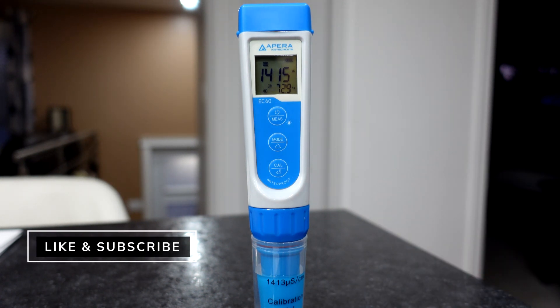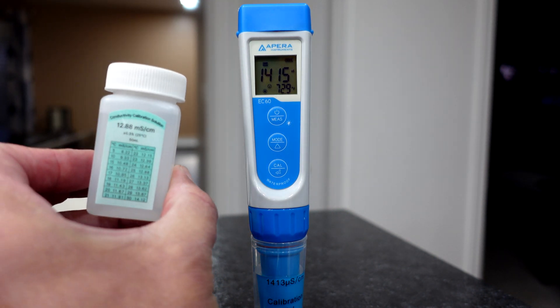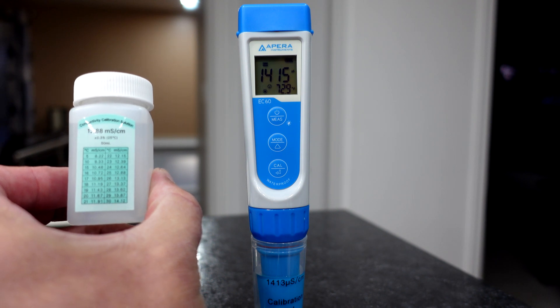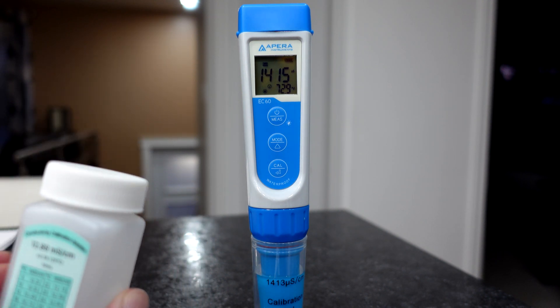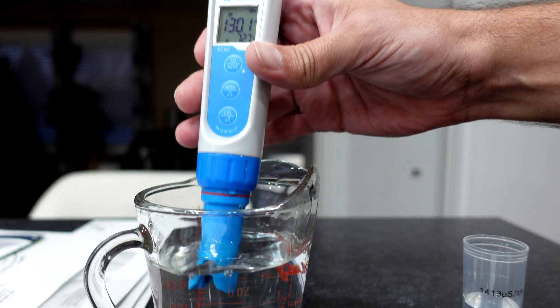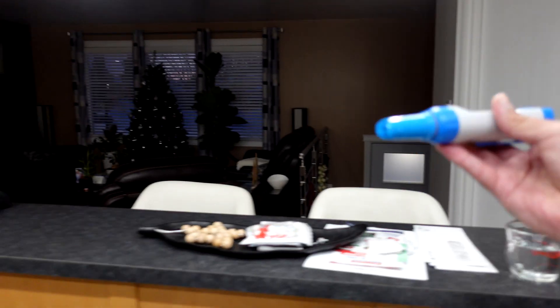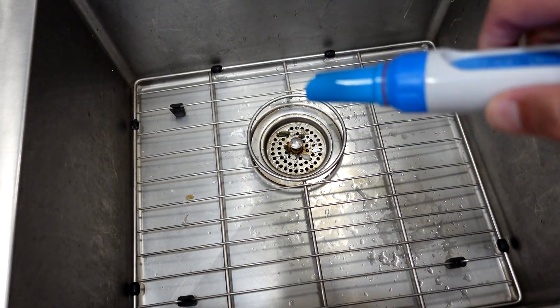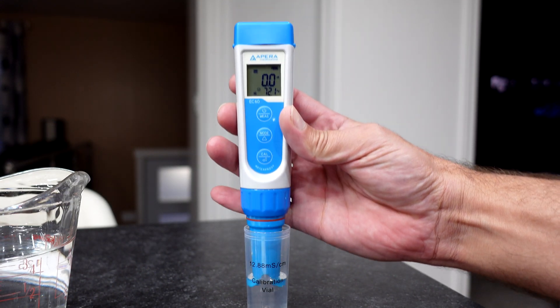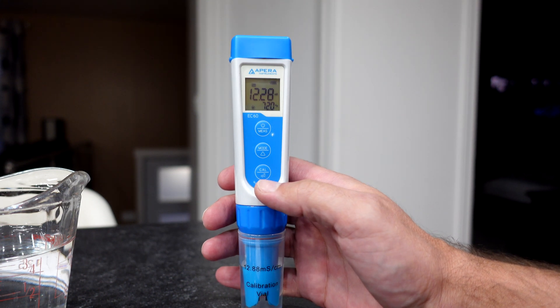For the last one, if we want to do a three-point calibration, we're going to take out our other test solution, which is this guy. That is the 12.88 mS/cm. We'll do the same thing — take that out, going to rinse that off in water, and then we're going to shake that off. Now we're going to use this solution.